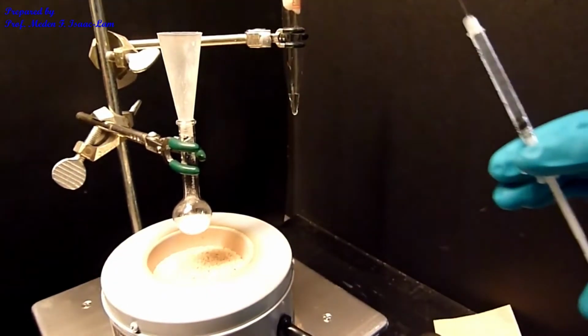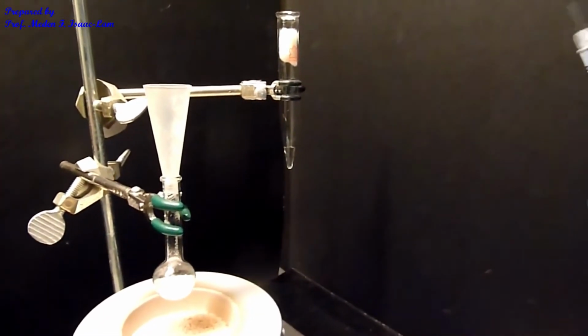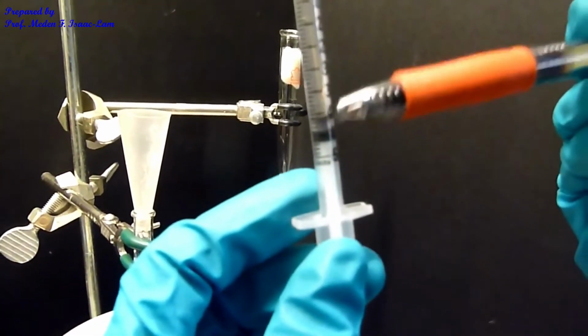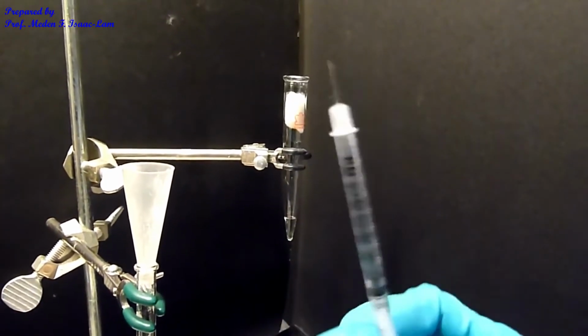So about 0.4 ml. So this is about 400 microliters here. So I'm just going to introduce it.